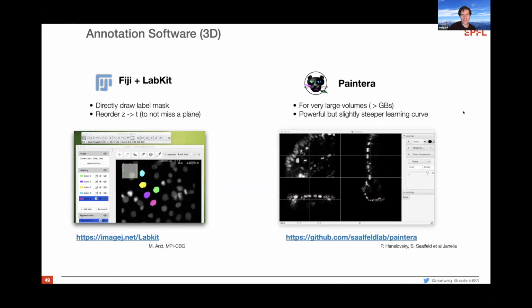Yeah. So you could, in principle, already do it now by yourself, because part of StarDist is a matching submodule that does matching of ground truth objects in 2D or 3D with the predictions. And of course, you could use that to match the output of different Z slices, and it will tell you which ones overlap. And then you would just go greedy, Z plane by plane, and fuse overlapping matched cell instances, right? So you could already do that if you want to try around with that. We just haven't packaged it into a nice API that is just a single line, but you can already do that. But it's an interesting question, yeah.